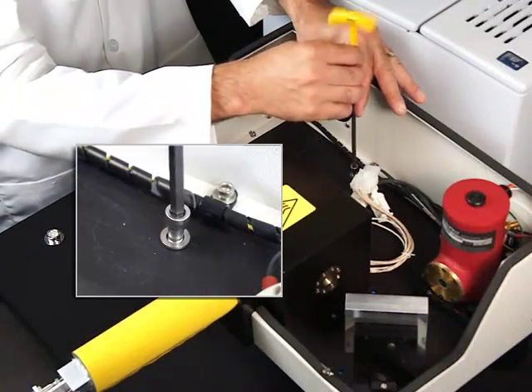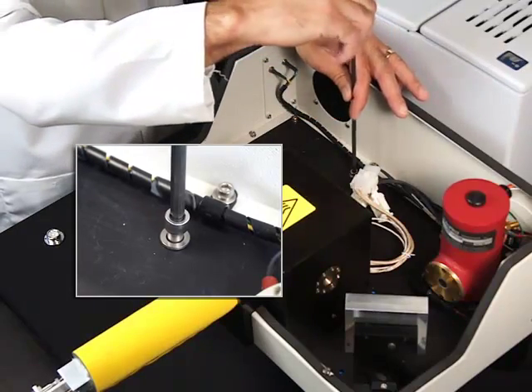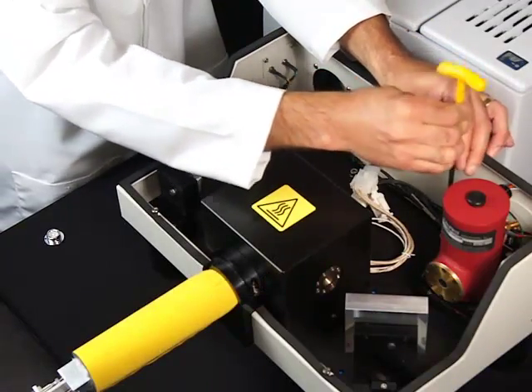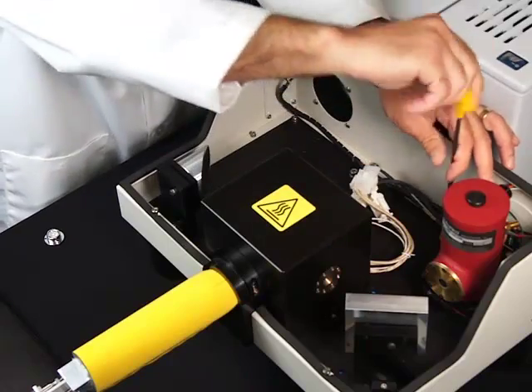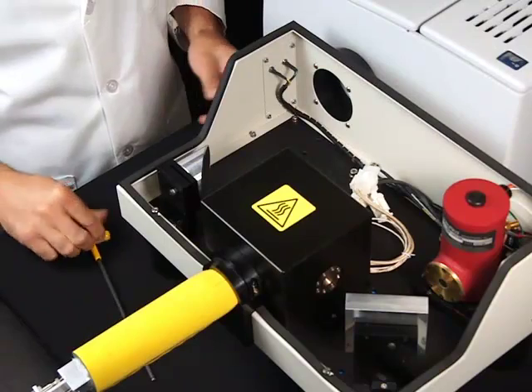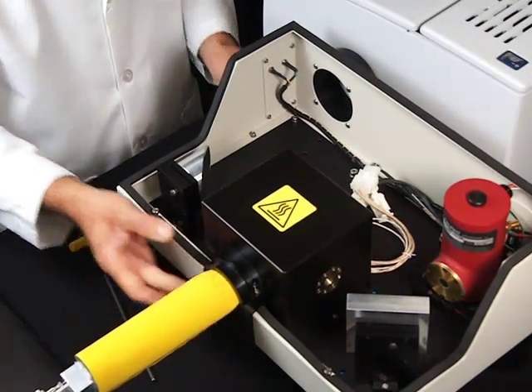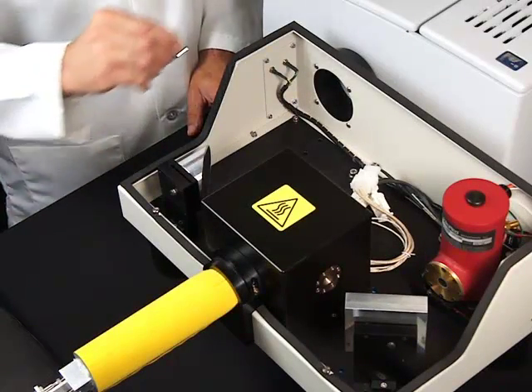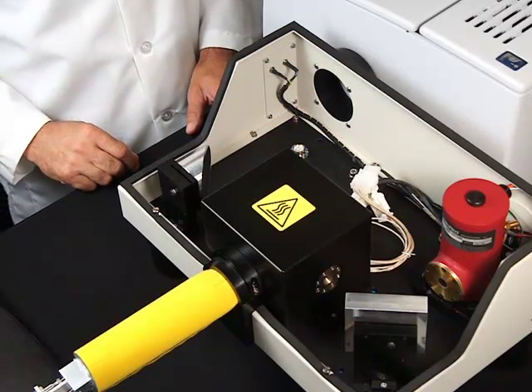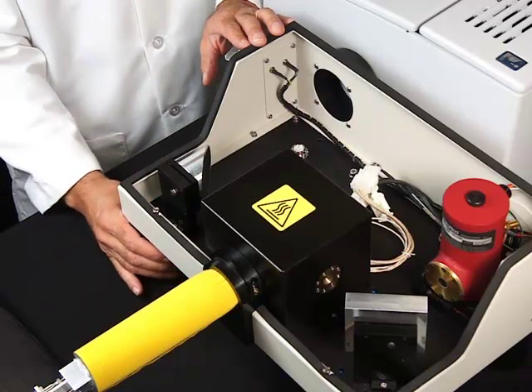Tighten the mounting screws until resistance is felt, but still allowing for slight movement of the accessory. Place the level tool and align the position of the accessory with the adjustable accessory legs until the base plate is completely horizontal.